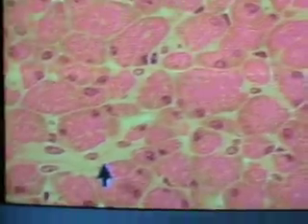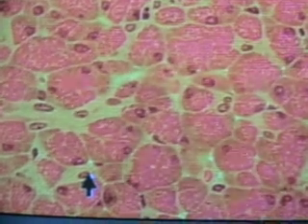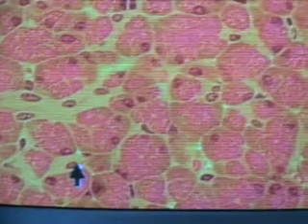They're all over the place here. You can see them, and this would be more of an intercalated duct that you'd see over in here, right there. Remember that these intercalated ducts are important as the first part of the cells that are going to be secreting bicarbonate ions. The central acinar cell and these intercalated duct cells are really critical in being able to change the pH of the lumen of the duodenum in order to get these enzymes to work and break down the food products, okay? So those are really important for you to see.